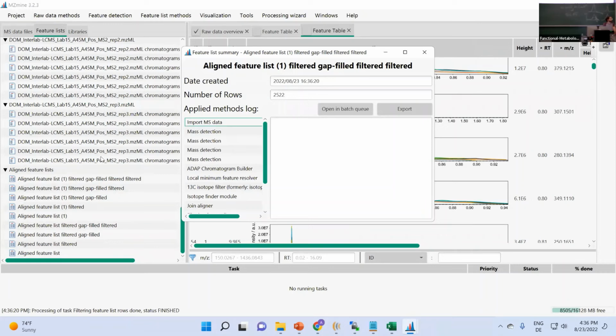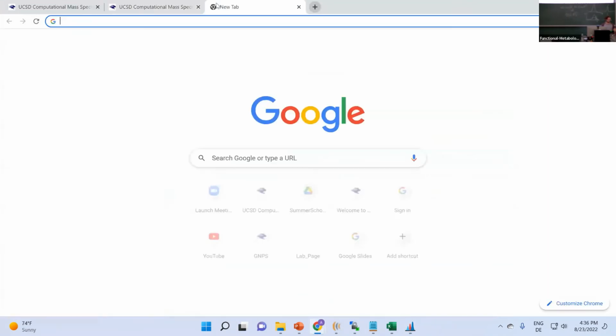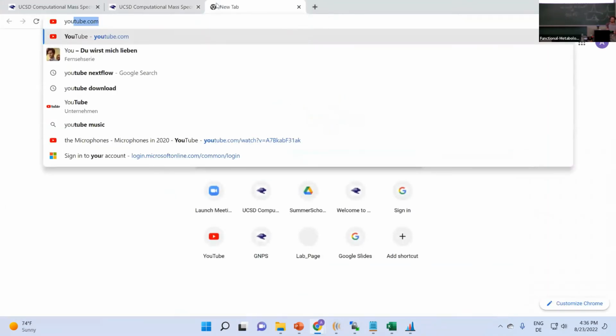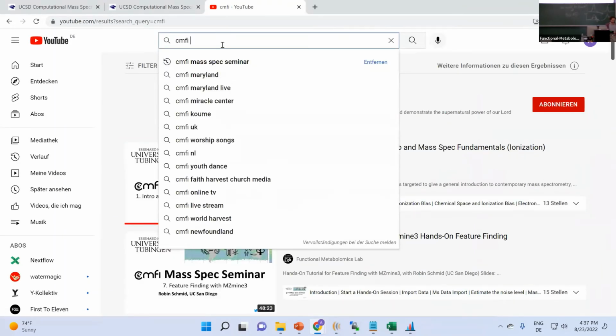And yeah, I guess by the end we get a good idea of how to proceed with that. I think for the MZmine session, unless there are some questions from you, that's all we wanted to get to. So basically, to submit the feature-based molecular networking job, and then tomorrow morning Allegra is going to walk you through and show what is actually happening now in GNPS under the hood with the data that we just submitted there. Okay, I don't know if there are questions for Robin and Stefan.